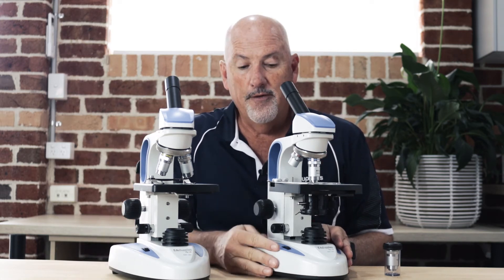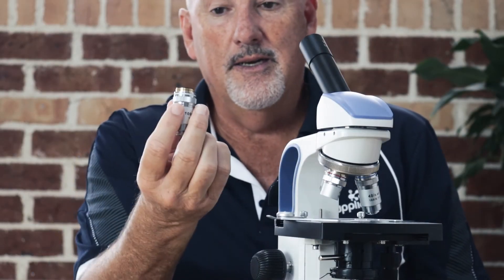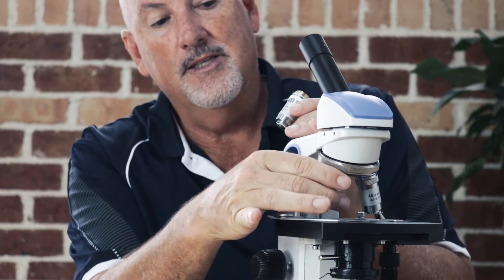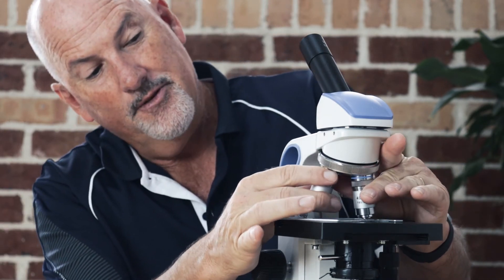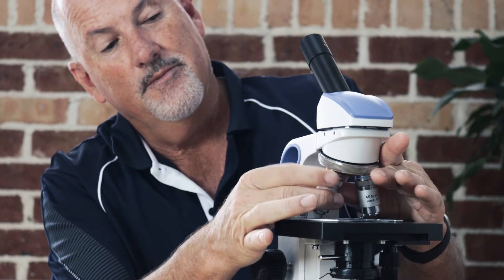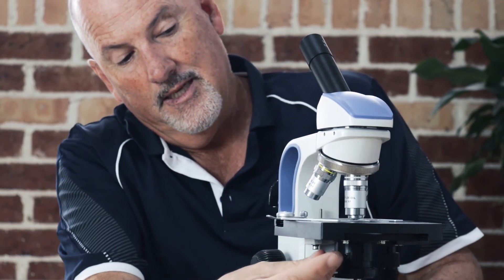Those are the two major differences. Everything else has been designed to be the same and compatible, so the 405 is a higher power, better quality microscope purely because of this condenser. If you purchase the EDU 405-100, you will be given a 100 times objective. Our recommendation is just to undo the 4x, put that away safely, screw the 100x into the spot where the 4x came from, and with this focusable condenser dropping down you'll get a really good image at 1000 times magnification.